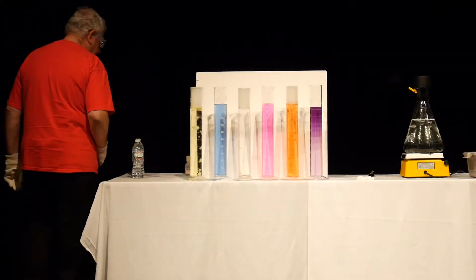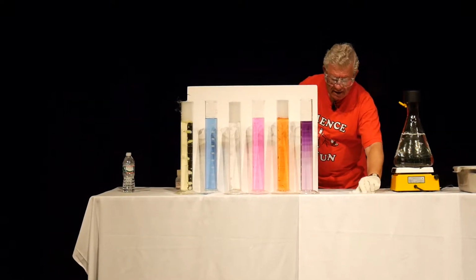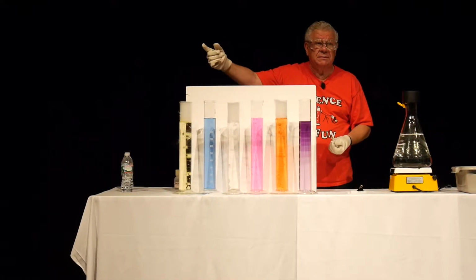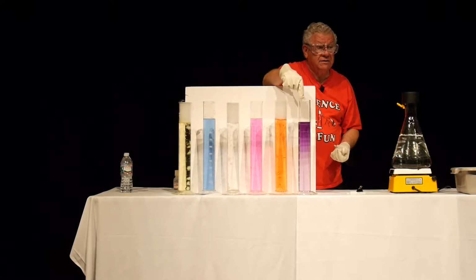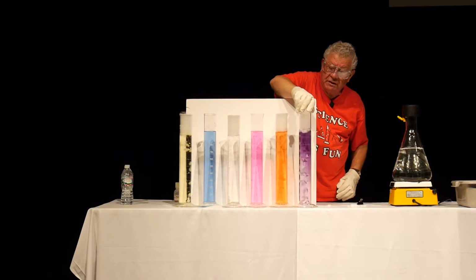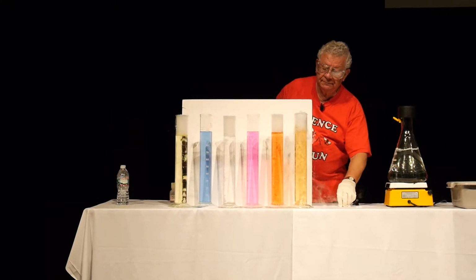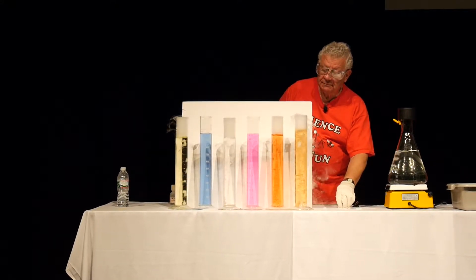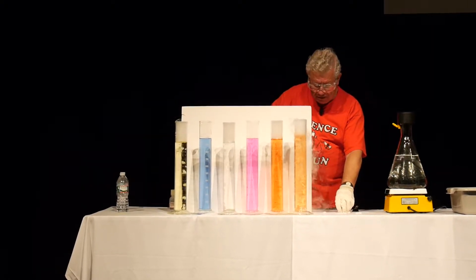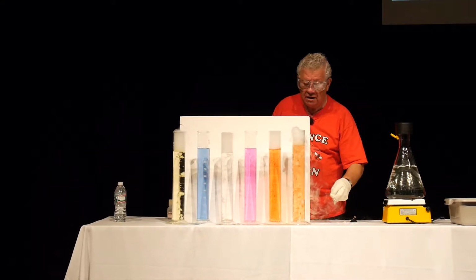All right, so what I'm going to do next is get some more dry ice. There it is. And I'm going to ask you to focus your attention on this cylinder right here. You can look any place you want, but if you want to follow my experiment, pay attention right on this cylinder here. As I take the dry ice and drop them in there, tell me how many different color changes you see out loud. 1, 2, 2. Are we expecting one more to happen? It hasn't happened yet, so we have to be patient, and we have to be always paying attention to what's going on, so we try to make some sense out of it.